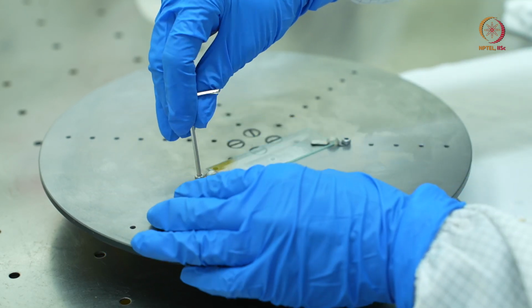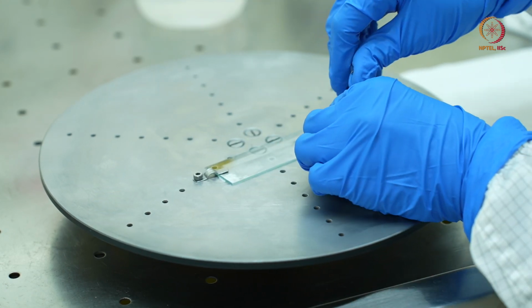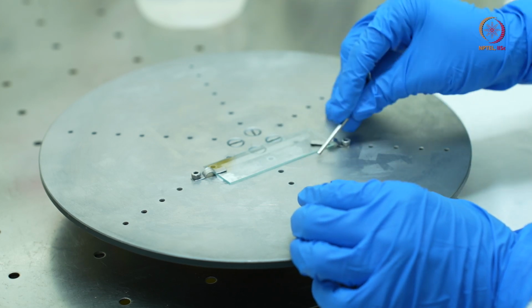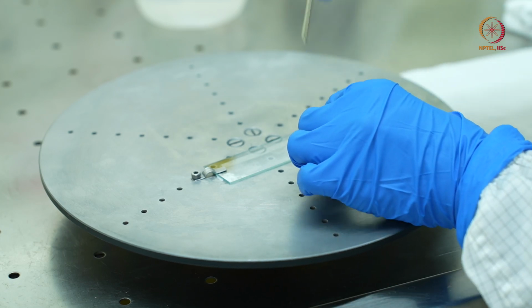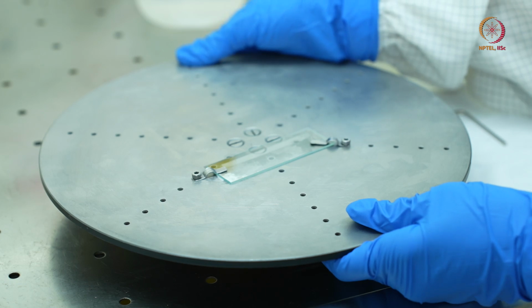Now we have tightened the screws, and we will check whether our slide is moving or not. It is not moving, so we are okay to take this substrate holder to the vacuum chamber.